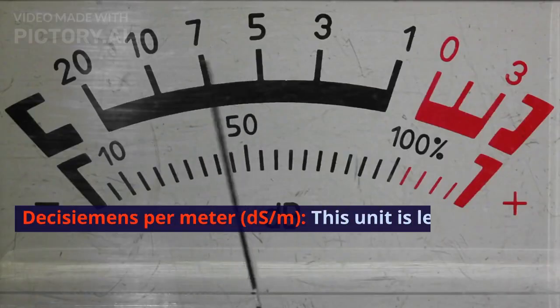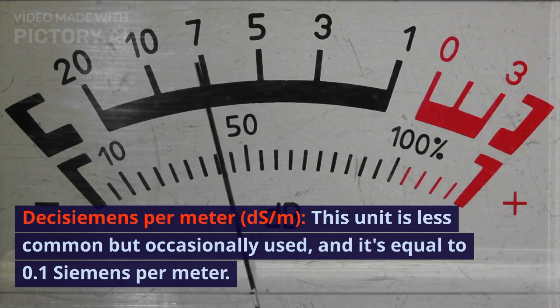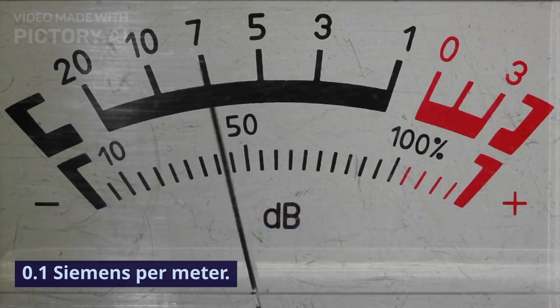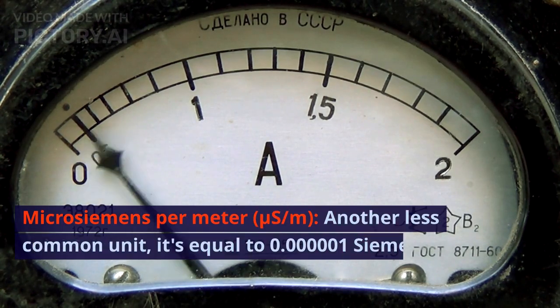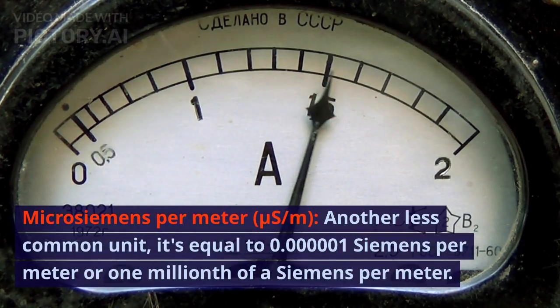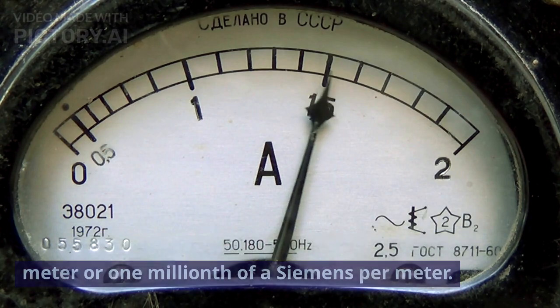Decisiemens per meter, dS/m. This unit is less common but occasionally used, and it's equal to 0.1 Siemens per meter. Microsiemens per meter, microsiemens/m. Another less common unit, it's equal to 0.000001 Siemens per meter, or 1 millionth of a Siemens per meter.